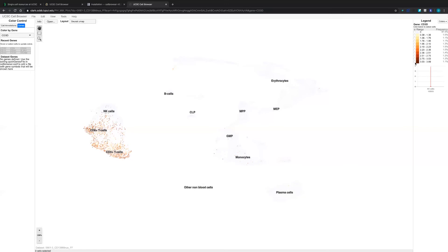From the right panel, we can select cells based on the gene expression level we are interested in. For example, if you are only interested in cells expressing CD3D at a level over two, you can select the ranges larger than two. From the middle panel you will see which cells are selected, and there is also a comparison plot where the left column is the cells you selected and the right column is all other cells, so you can directly see the difference between the two groups.